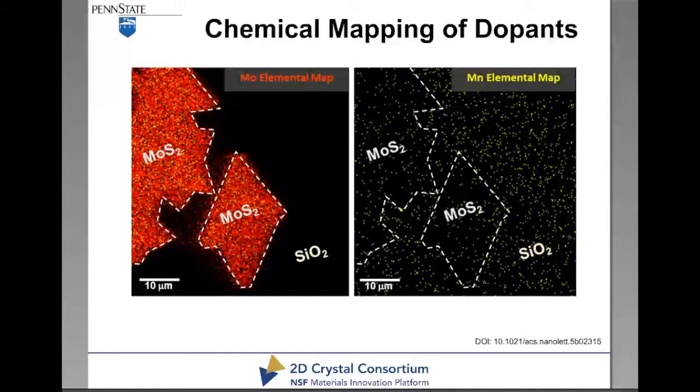The question was, what are the differences between TOF-SIMS and ICP mass spec sensitivity? Yeah, the inherent sensitivity is probably comparable for both, but ICP-MS is a bulk technique and, with standards, is very quantitative. TOF-SIMS has similar kinds of sensitivity, but really just samples the outer surface and is generally not quantitative. Yeah, that answers the question.